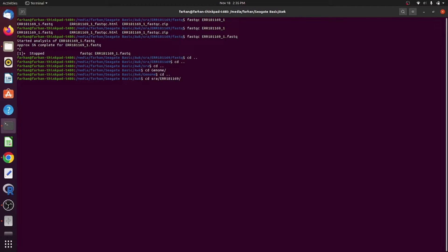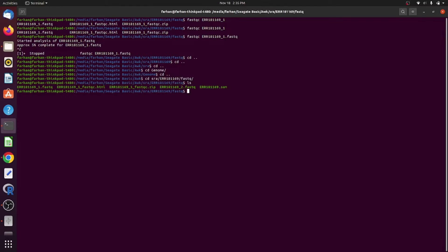Now let's see how FASTQ to SAM conversion can be done. As the files we have are paired-end sequencing files, what you need to do is type BWA-MEM, then the location of your annotated reference genome, the FASTQ forward file, the FASTQ reverse file, and lastly store it in an output file with the extension SAM.